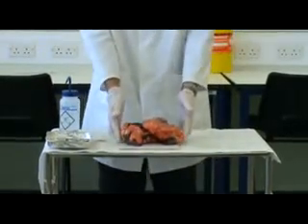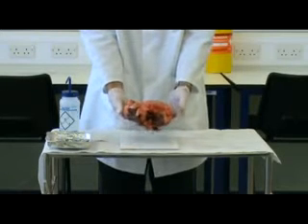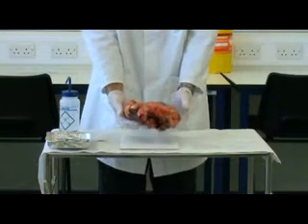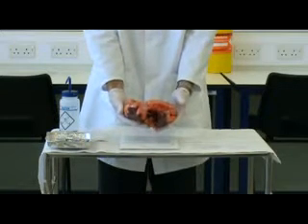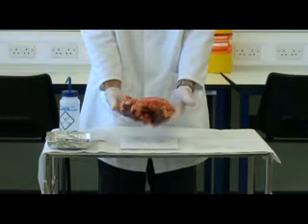But of interest, before that, if you'd like to lift it, it's surprisingly quite heavy. If you estimate, it's under 2 kilograms, about 1.5 kgs.